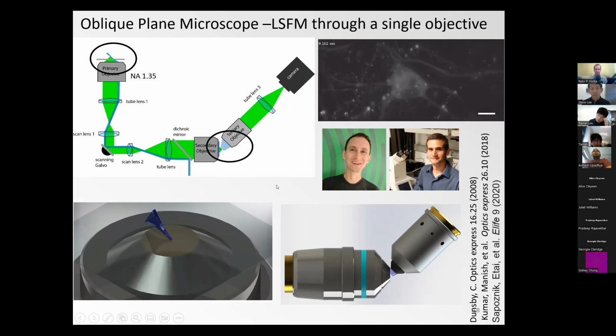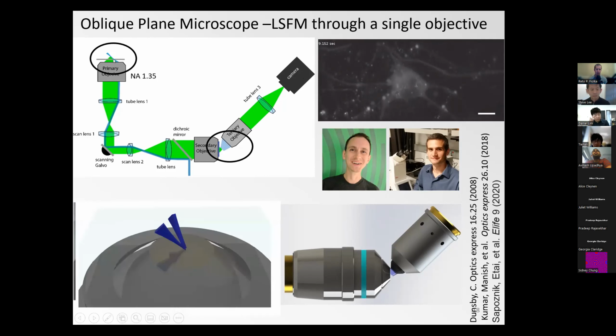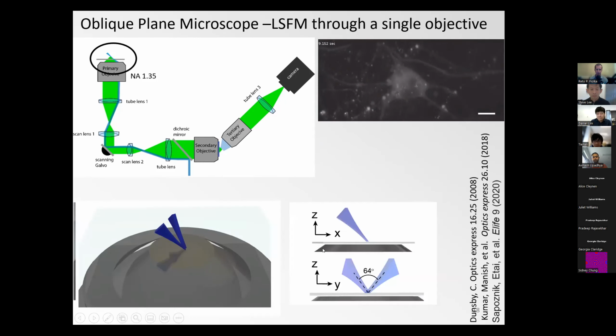All right, so this is OPM and also why we got interested in OPM. But what does that have to do with structural illumination? So what we realized is that instead of a single light sheet, we could also launch out of this high-NA objective 2 light sheets that would come out at an angle. This would look something like this. From the side, they would be propagating in the same tilted plane, but if you look at it from the back, they would essentially diverge from each other, an opening angle of maybe 60 degrees. That's roughly a numerical aperture of 0.8, so not too bad.